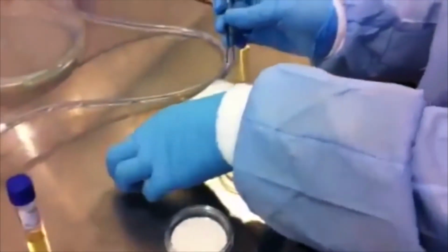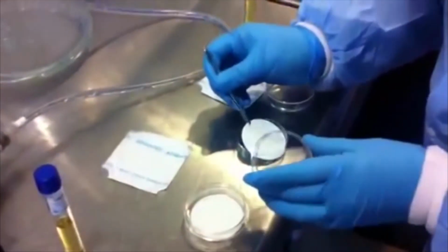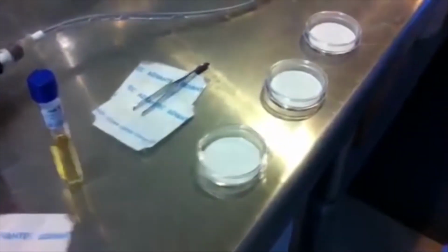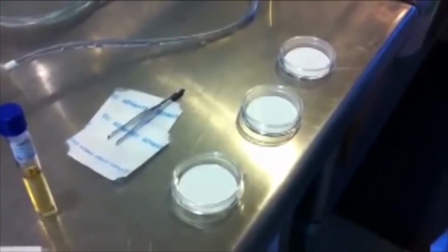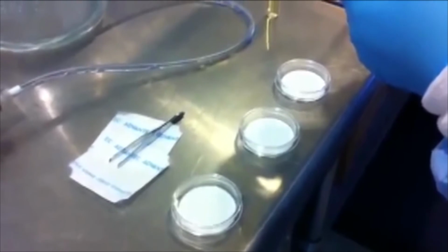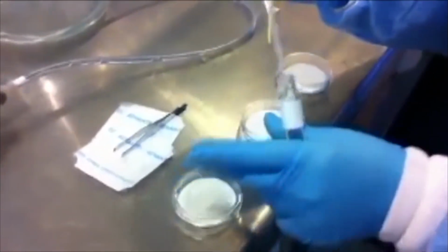Right. This tube could be an ampule media. Usually it's an ampule. Right here, she's putting the absorbent pad down into the empty Petri dish. This is one way to do it. Another way to do it would be to put it right onto a pre-poured Petri dish. For example, like the universal beer agar plates we make for Miller Coors. In this case, we're going to be saturating the absorbent pad with the media, and then we're going to be placing the membrane filter onto that pad, and once that's done, we can incubate and then count for colonies.